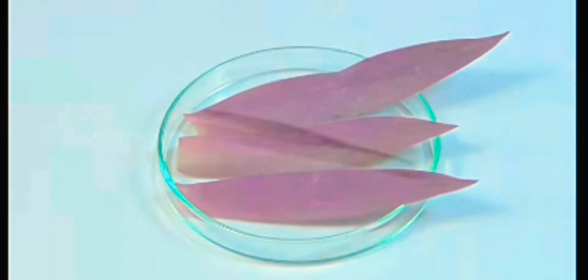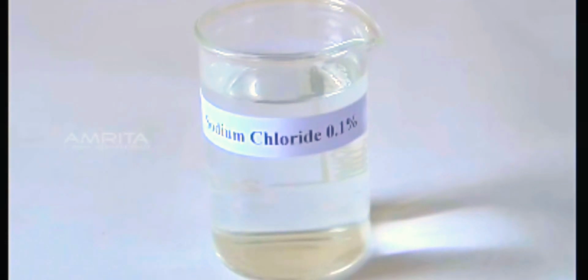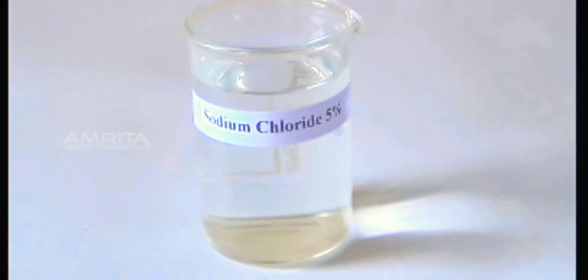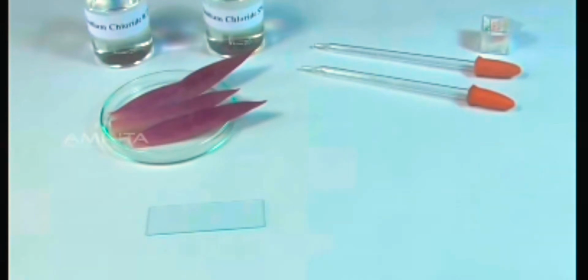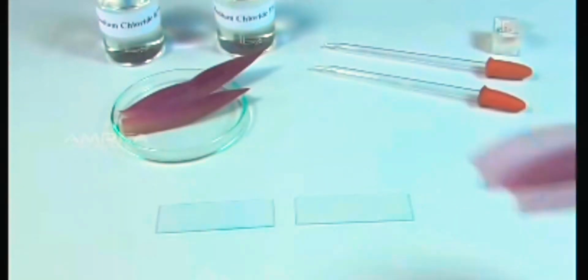The materials required for this experiment are the Rhoeo leaf, forceps, slide, cover slip, compound microscope, needle, tube, and sodium chloride of two concentrations. Here sodium chloride of 0.1% concentration is used as the control set and 5% will act as the experimental set.